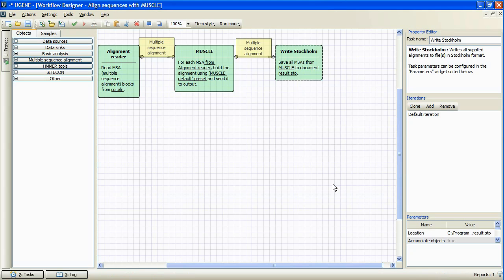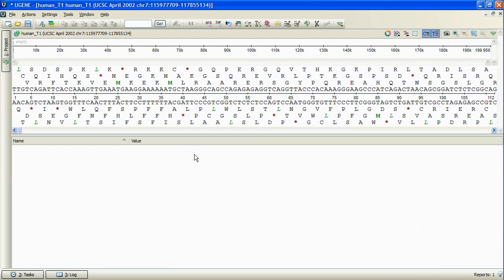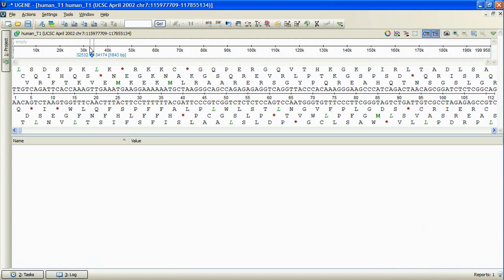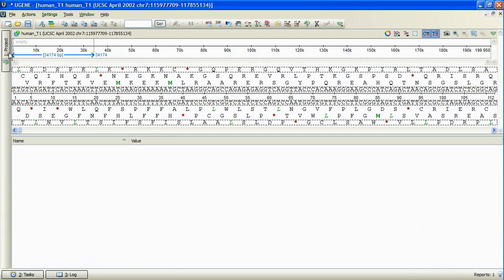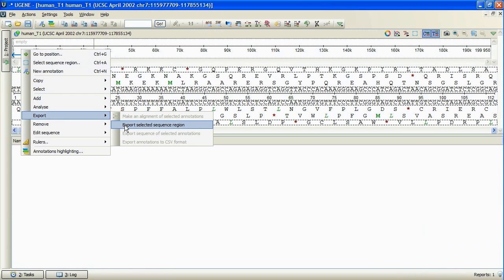UGENE sequence export dialog has been improved significantly. Let's open a nucleotide sequence. Now we select some sequence region, bring up the context menu and select export selected sequence region.